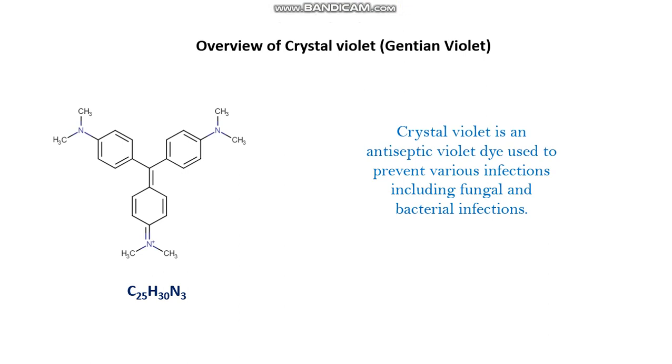In this tutorial video, I'm going to talk about crystal violet staining. Here I will discuss the overview of crystal violet staining, the different applications of crystal violet staining, and the protocol. So let's begin. First is the overview of crystal violet staining.